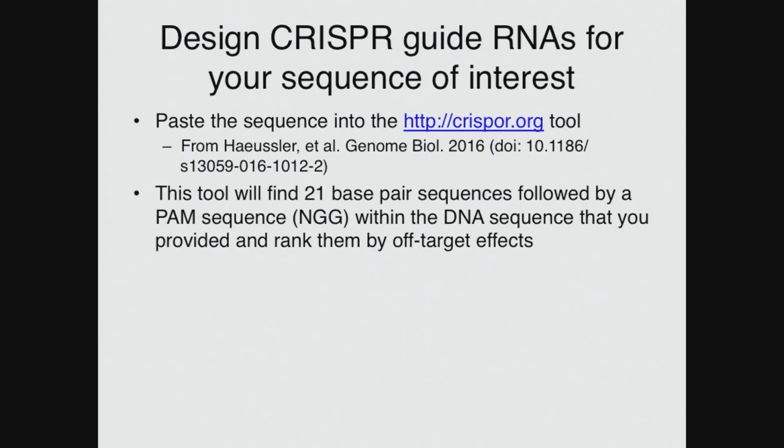You then paste the sequence into an online tool. Again, this is all very easy. This tool I've actually never used. I used to use the tool from the Zhang lab at MIT, but they've recently said that their tool is actually outdated, and this is the one they've been recommending from a recent review that sort of tried to look at all of the options.